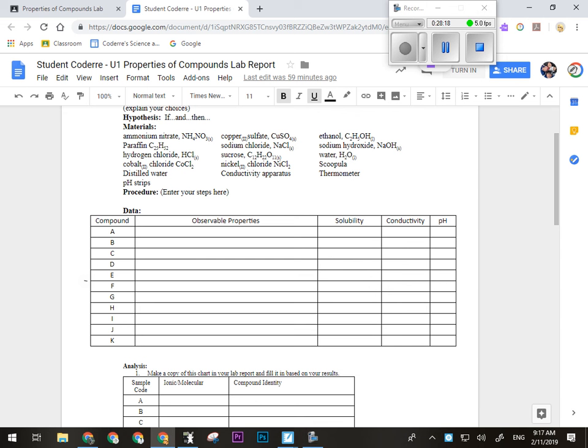Should you tell them what to do after the experiment? What should you do after the experiment? Clean up. You always got to clean up. If you have your fun, then you got to clean up. So you tell them things like, take the unknown samples to the waste bucket. These don't go down the sink, right? Cobalt and hydrochloric acid and sodium hydroxide cannot go into the sewer system. They're very bad. So they go into the waste bucket, which is in the fume hood.